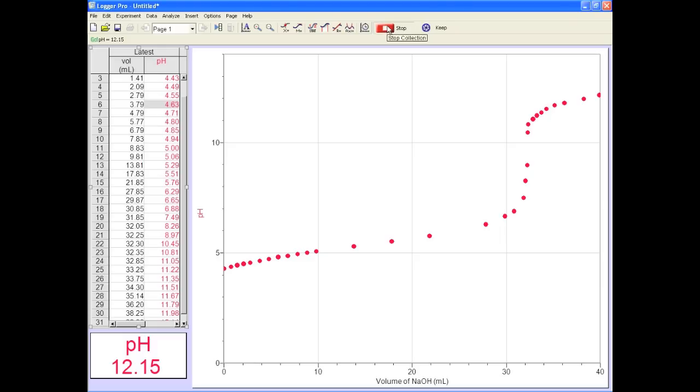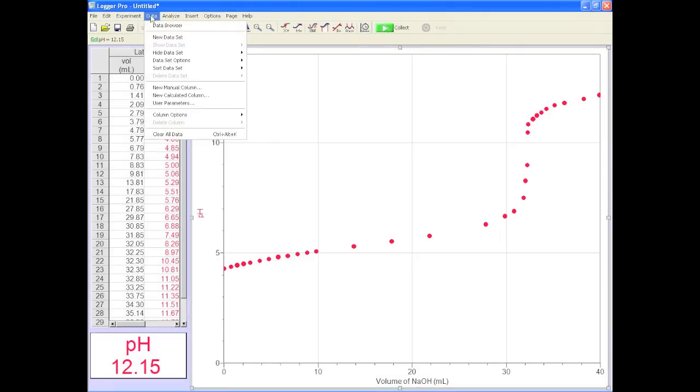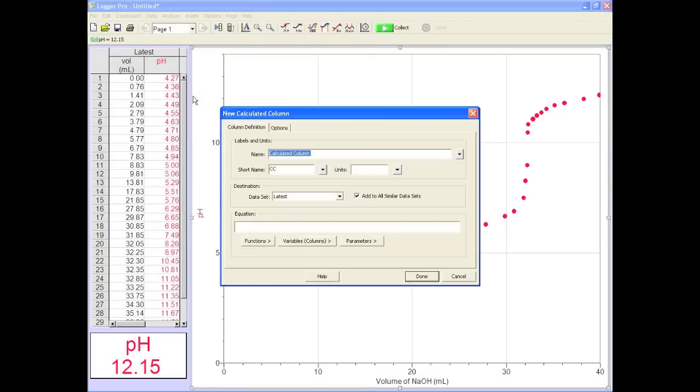Now it's kinda hard to find the equivalence point volume with this curve, so here's how to get a better idea with some first year math. Don't worry, the computer does it for you.